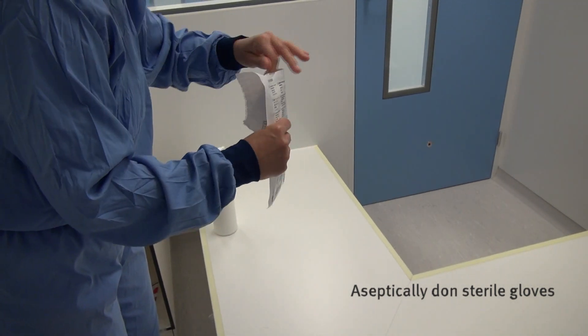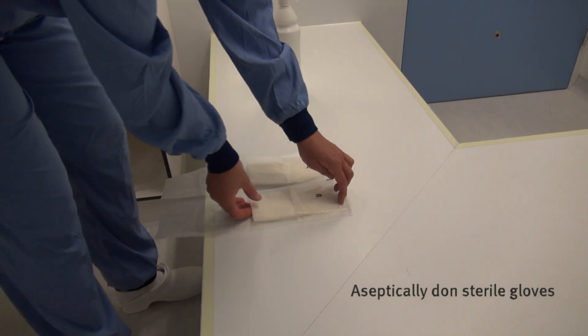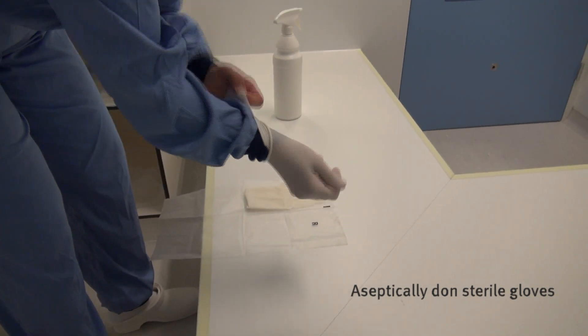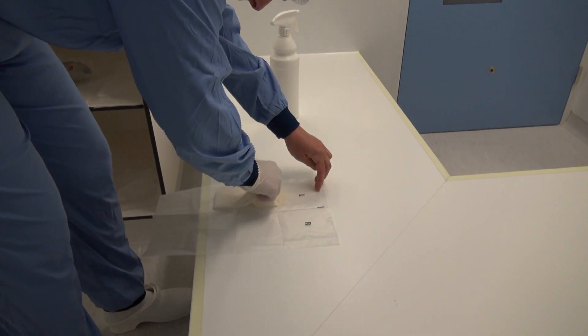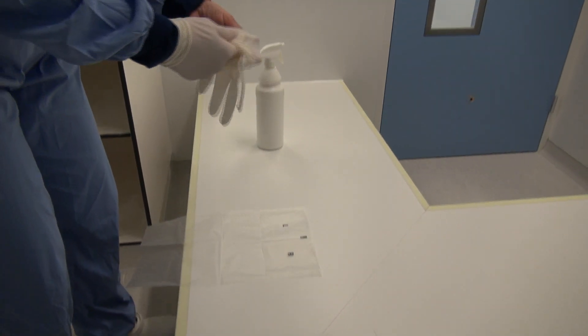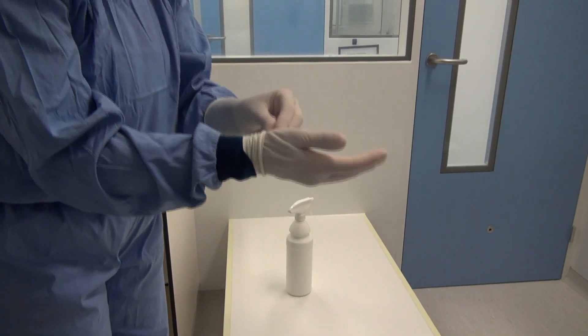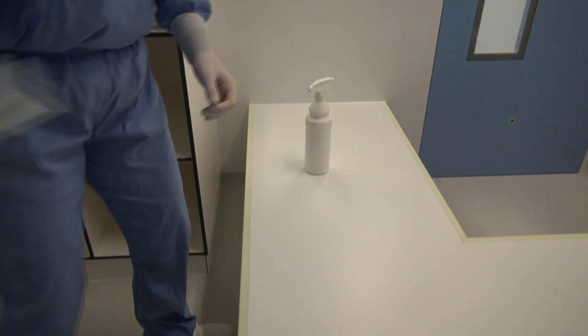First, aseptically don sterile gloves. Do not touch the outer surface of the sterile gloves with your bare hands. Do not talk while donning your gloves. As a preventative measure, disinfect your gloves after each step of the gowning procedure.